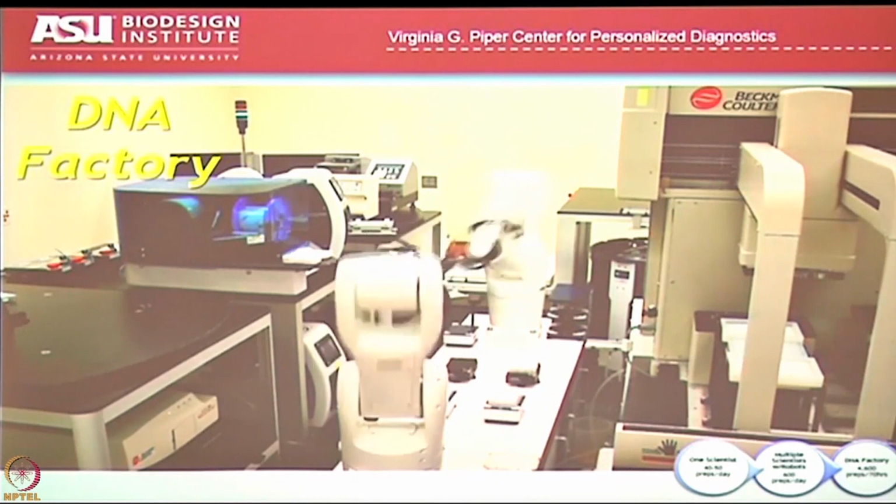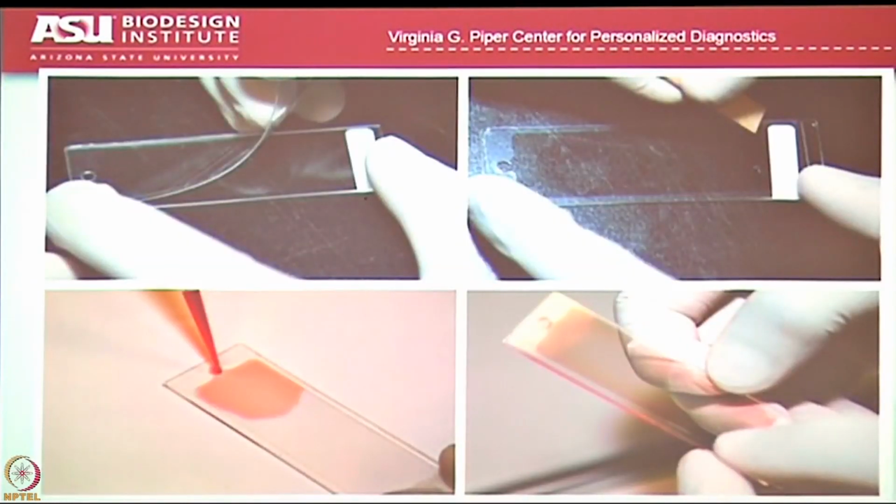So this is how we actually make the chips. And I think you guys have examples of this at your desks. You have this cover slip here that you put on the chip. There's a little hole here and a little hole here. You inject your lysate in here. You fill it all up. Make sure you don't get any bubbles. That's always the trick. One of the things you have to learn how to do. And then you can make the proteins on the chip using this approach.